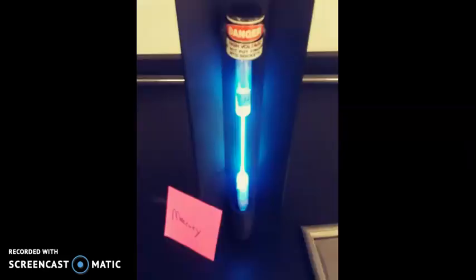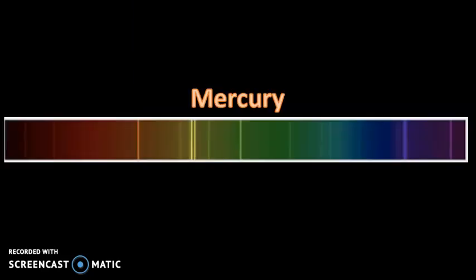Another interesting one. Here is mercury. Very bright, very blue. In front of the C spectra paper. What I think is kind of interesting about this image is I see red, orange, yellow, green, blue, and purple. Every single one of the colors from the rainbow. And I think you'll hopefully see that when we see the official spectrum. You can kind of see there's at least one big band from every single one of the major representative colors.